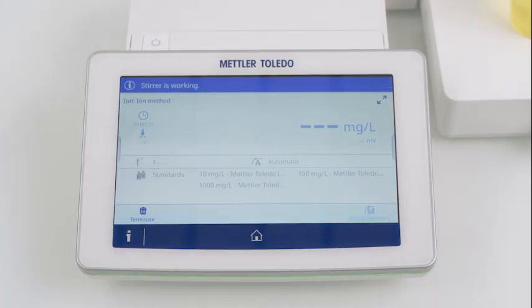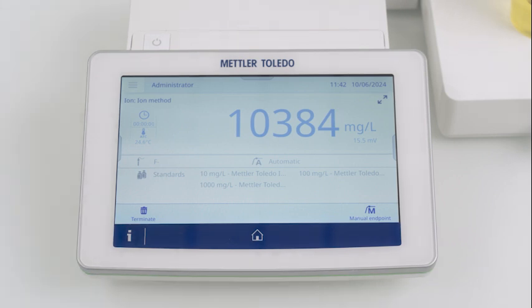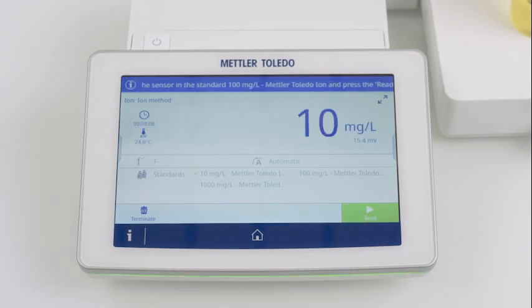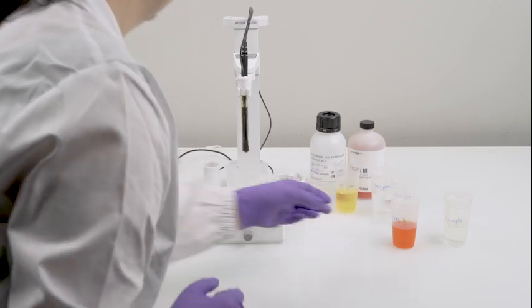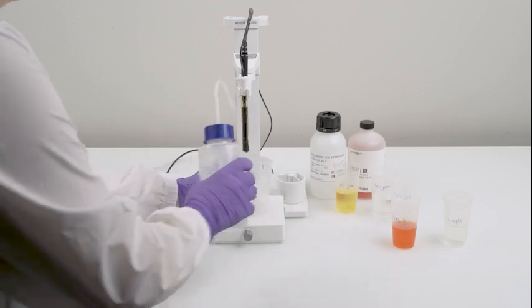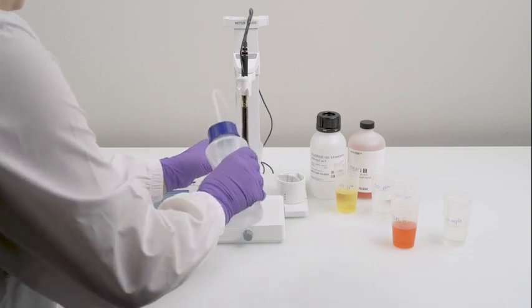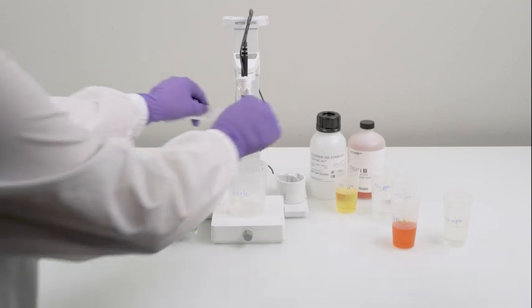Don't forget the temperature probe and stirrer. Press read and record the reading. After calibrating one standard, use distilled water to clean the sensor thoroughly, and dab it dry with tissues.